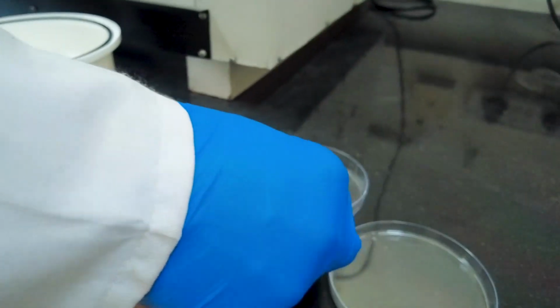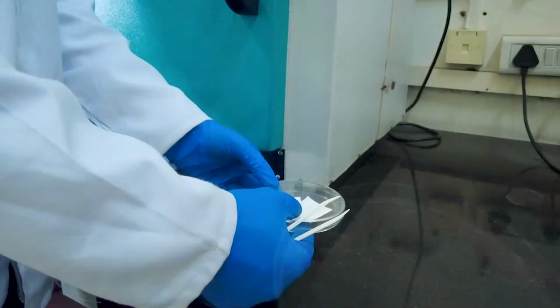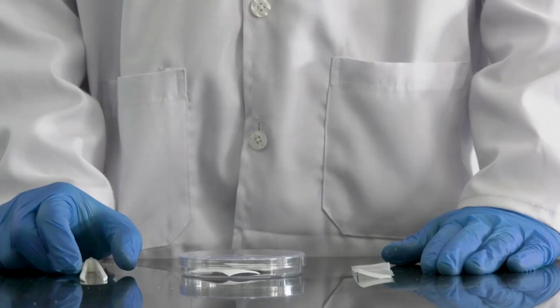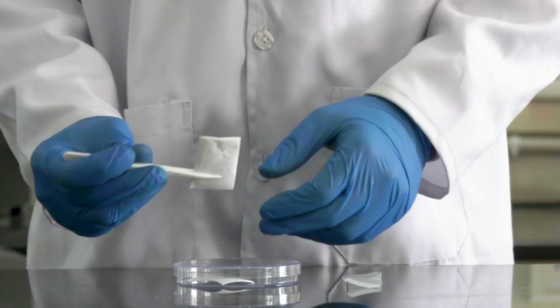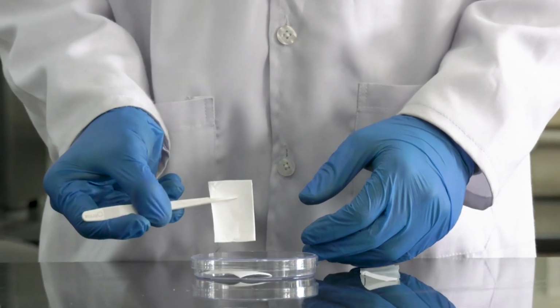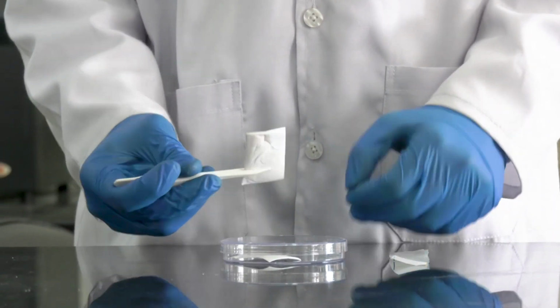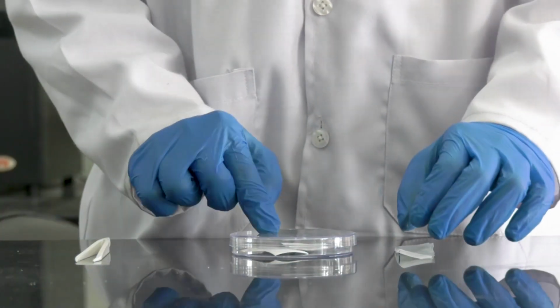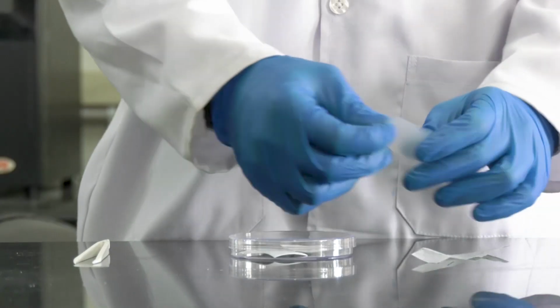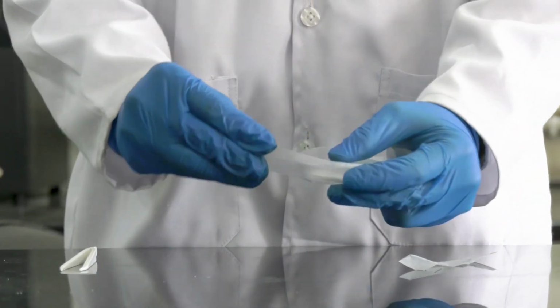After cross-linking, store the nanofibers in a petri dish, covering them with parafilm as they are highly sensitive.